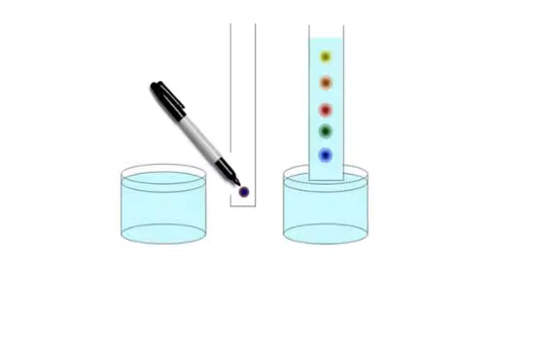Other thing we're going to do is we found out there are some writing utensils. There were pens there at the crime scene. We're going to do a very simple test. Again, you're going to use a beaker. And this time you're going to cut some strips of coffee filter. You're going to mark, as it's shown here, all these different tips. Just a little bit of ink sample right there.